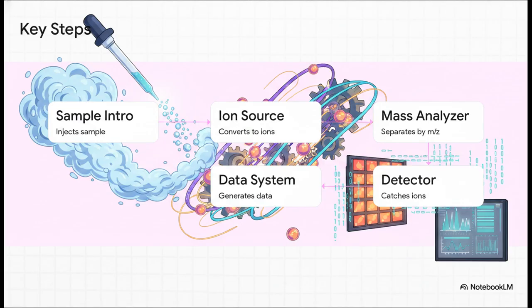First up is the sample introduction system, where the material is injected. Second is the ion source, where those neutral molecules get zapped into charged ions. Third is the mass analyzer. This is the heart of the machine, where the crucial separation by mass-to-charge ratio happens. Fourth is the detector, which catches the sorted ions.